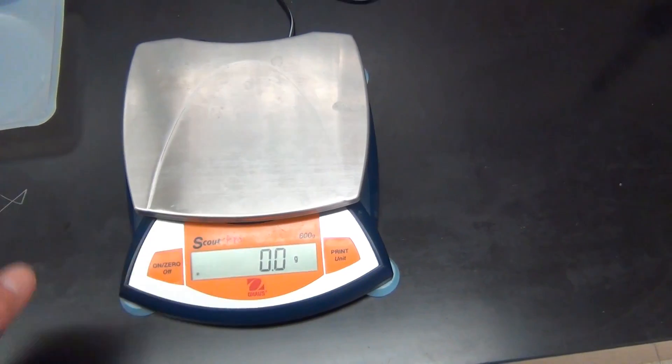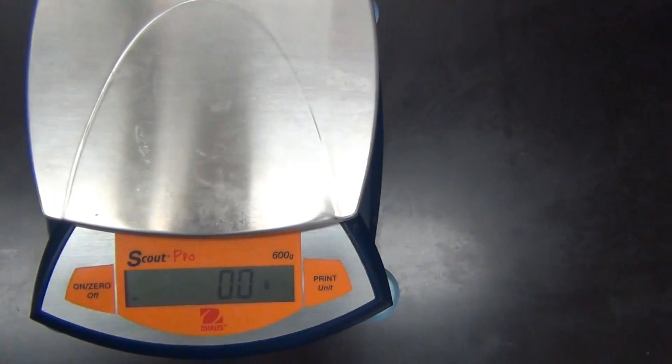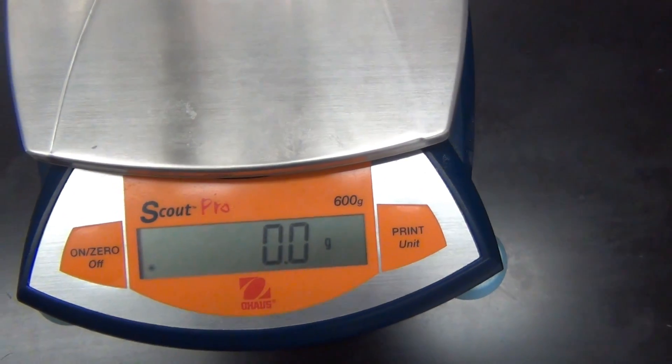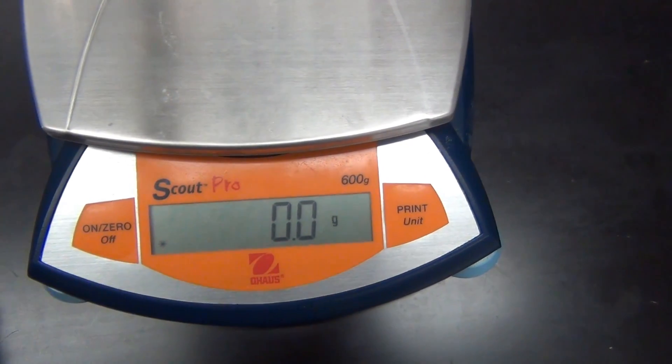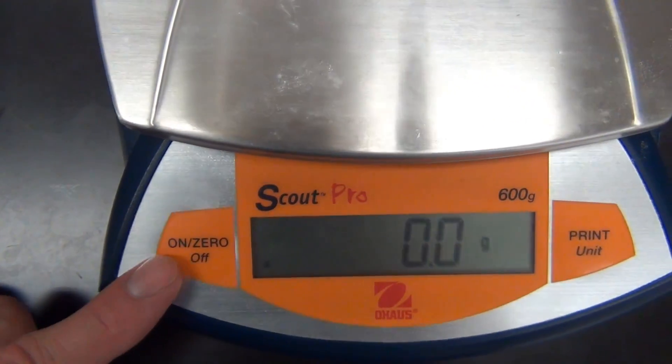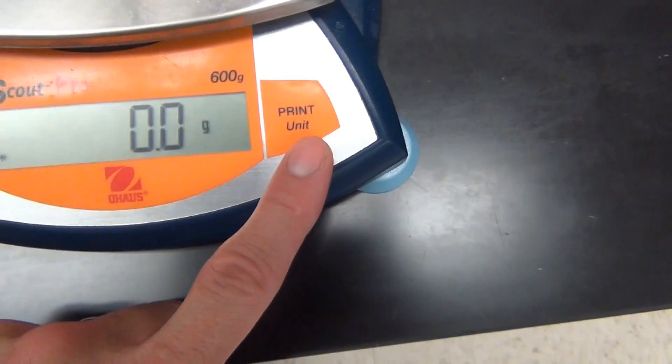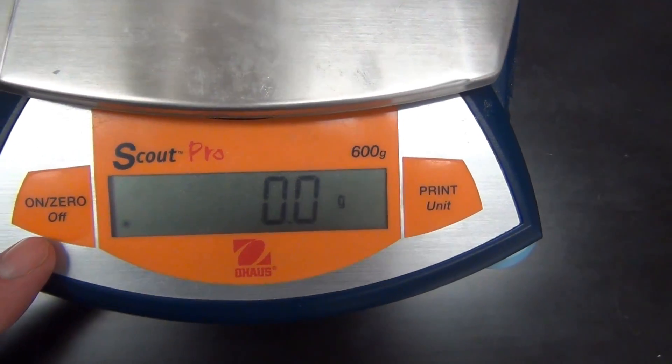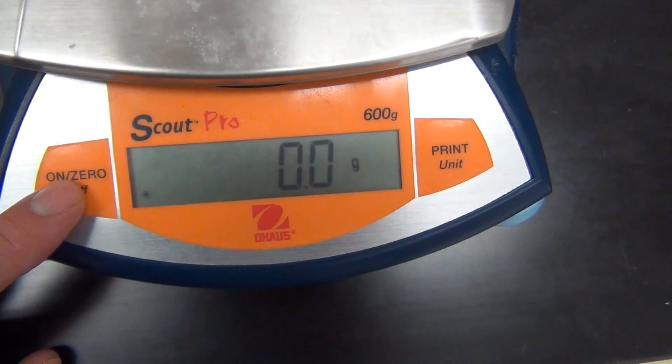This balance right here is a top loading balance. And as you can see, it will measure to the nearest tenth of a gram and it will measure up to a 600 gram limit. As with any piece of equipment or instrument, you need to be familiar with the buttons on it. There is an on-off switch and there is also a print unit button which we will not be using. However, this switch will be very important as it also is the on-off switch as well as the zero switch.